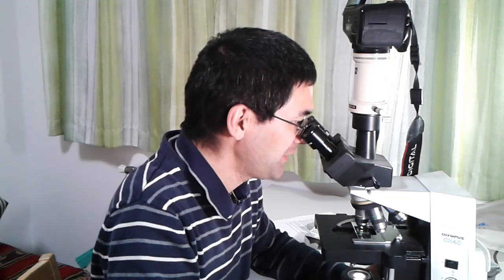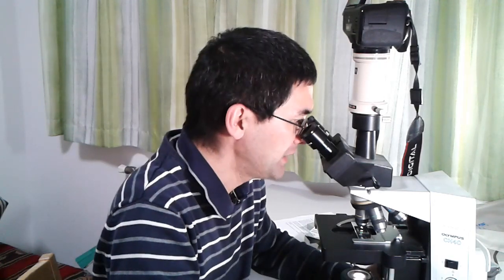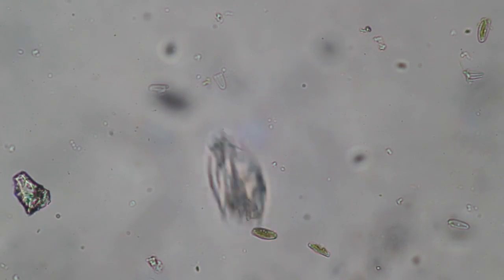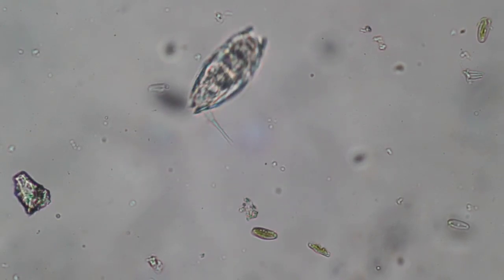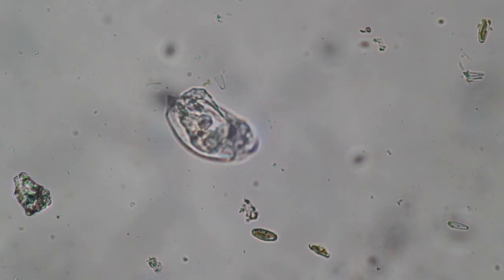I think that sometimes the organisms that are growing on the moss are even more interesting than the moss itself. I think I found a rotifer moving around in my field of view. That's a little bit unexpected because the moss itself was actually not submerged in water. I think that by picking up the water sample, this is where the rotifer originally came from, and that it did not really live on the moss originally, because I picked up the moss from a rather dry area. It does seem to be some kind of a rotifer — it is connected to the glass slide with a so-called foot. And I think there was also a second one somewhere.